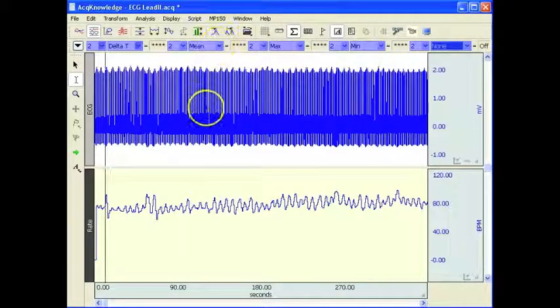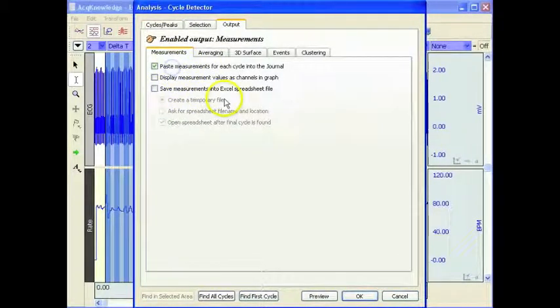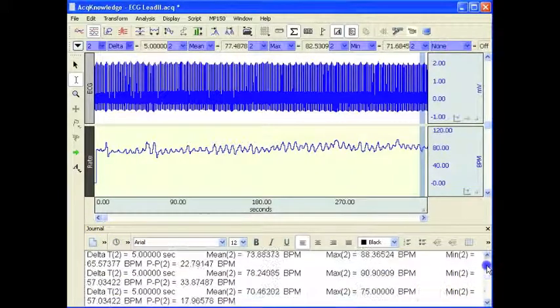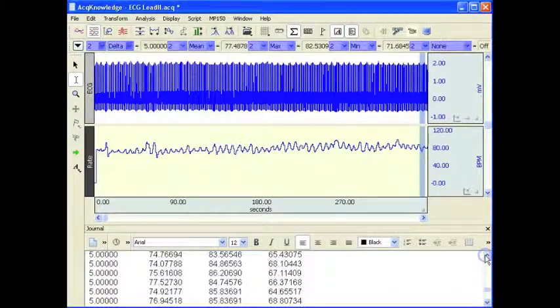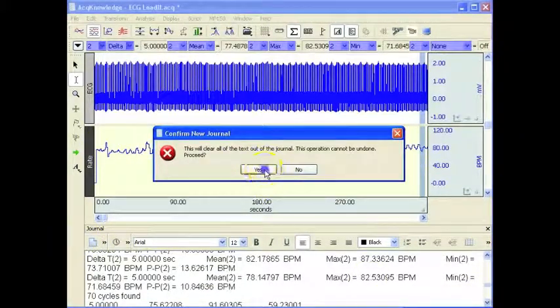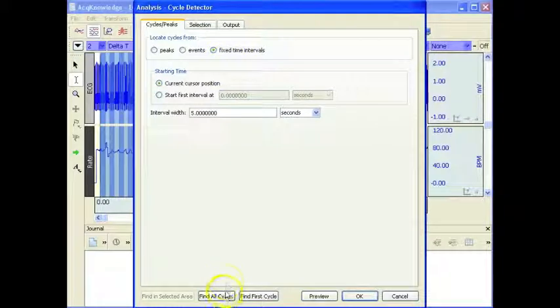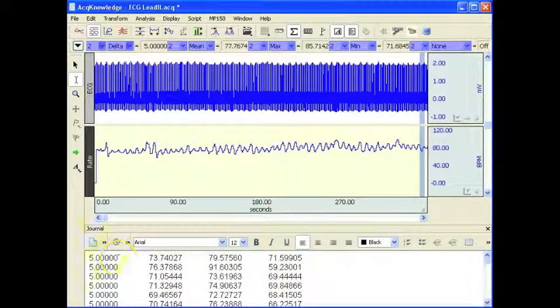I'll come back and do exactly the same analysis again, but paste it back down into the journal. Go to Output, turn that off into my journal. Find All. And there we go — all the measurements recorded. Clear all that out, start at the beginning. Find All Cycles. And there we have it: the delta time period, the mean, the maximum, and the minimum within the 5-second period.